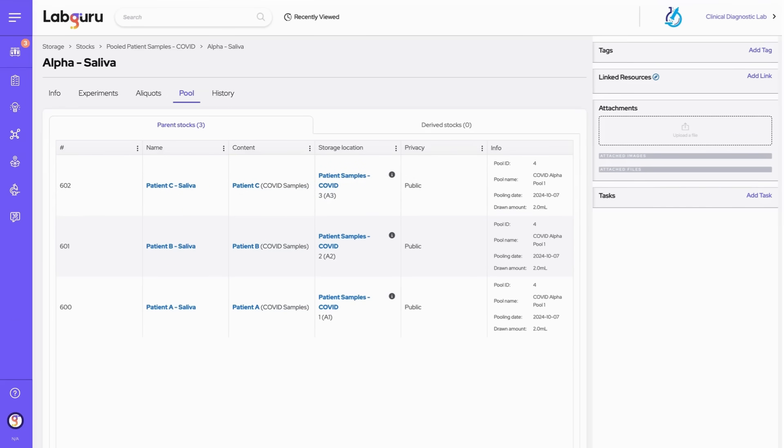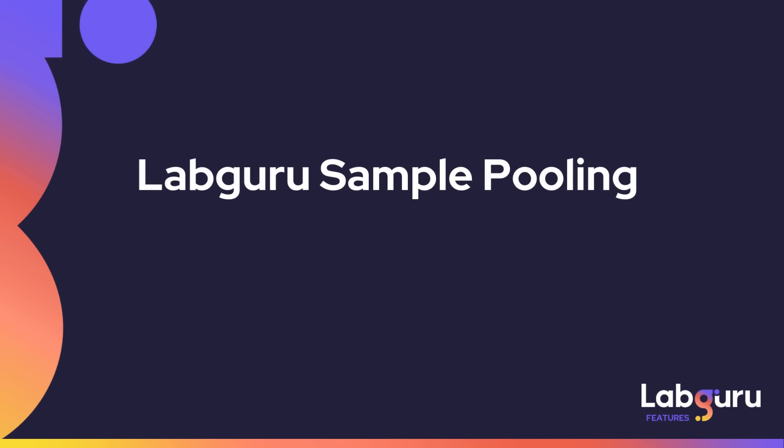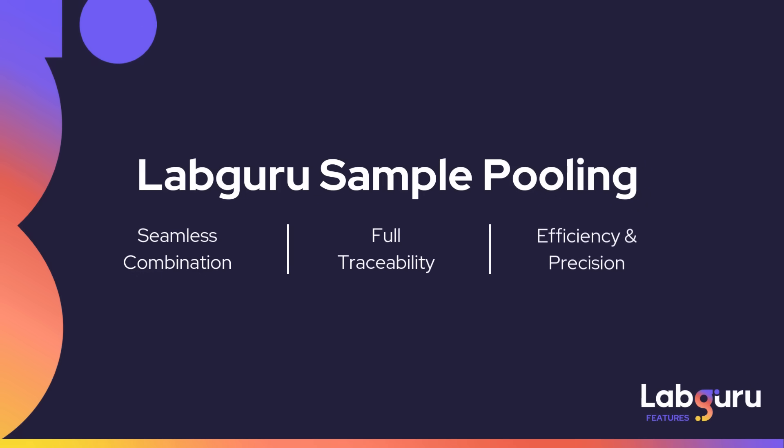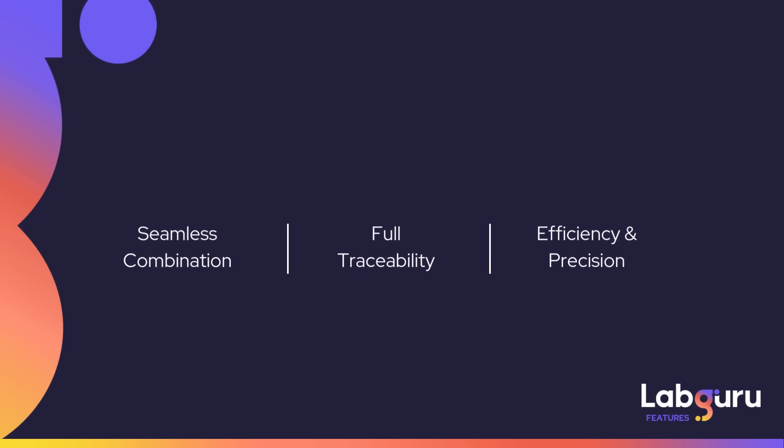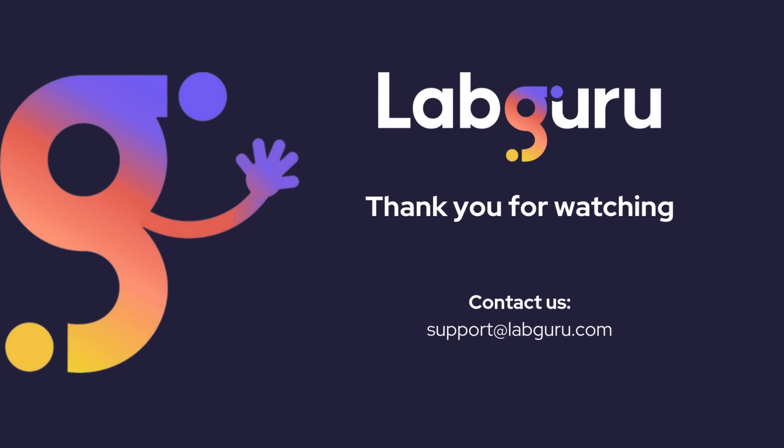Labguru's sample pooling feature empowers you to seamlessly combine, track, and manage samples with full traceability, driving efficiency and precision at every stage of your research workflow. To learn more about Labguru, contact us.